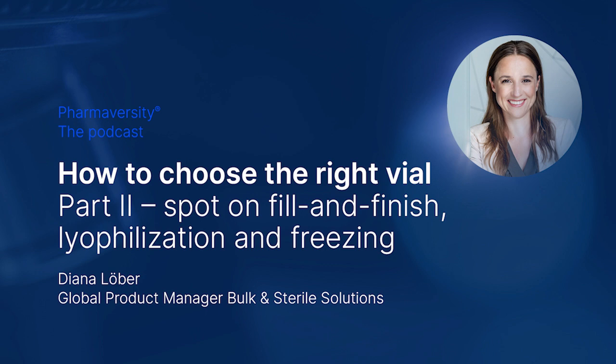So, I mean, of course, transportation is always a risk factor. So, how to make sure that the vials do not get damaged when taken to the filling provider or being taken to the point of sale later on. And in addition, of course, freezing. So, this can have a critical influence on the risk of breakage. And what happens during freezing? What is so critical there?